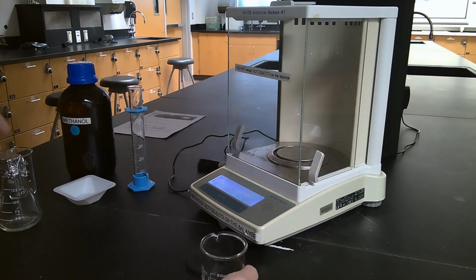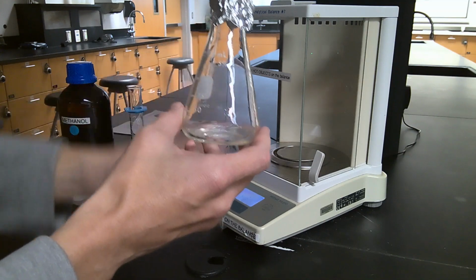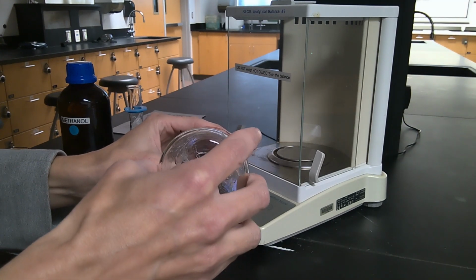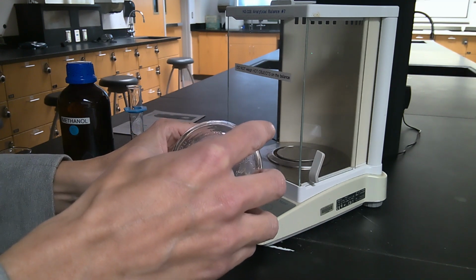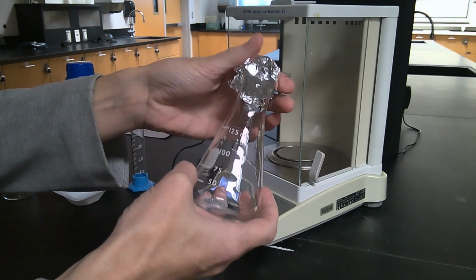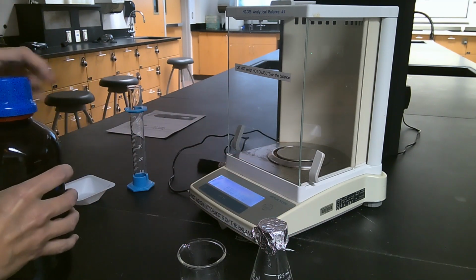All right, so now I'm going to decant the liquid methanol into the beaker. I'm going to rinse that with a little bit of additional methanol.